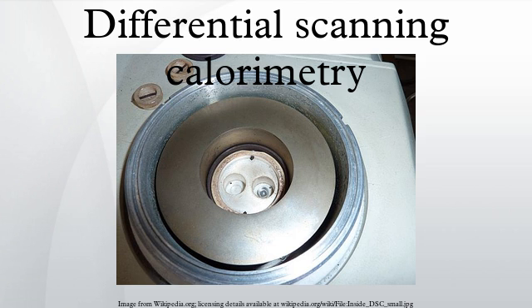Safety screening. DSC makes a reasonable initial safety screening tool. In this mode, the sample will be housed in a non-reactive crucible, which will be able to withstand pressure. The presence of an exothermic event can then be used to assess the stability of a substance to heat.